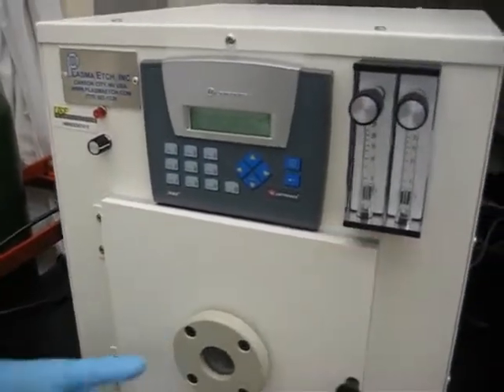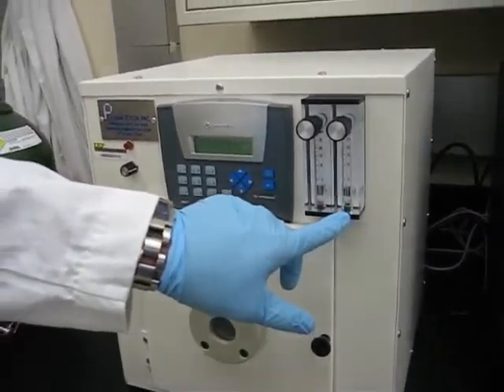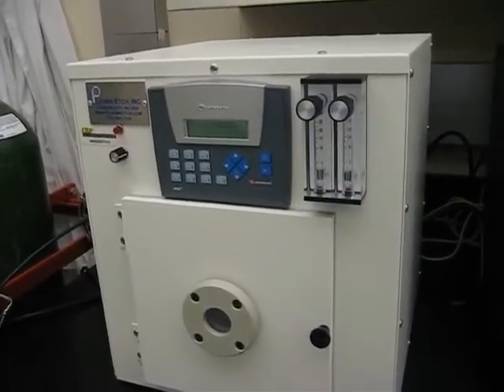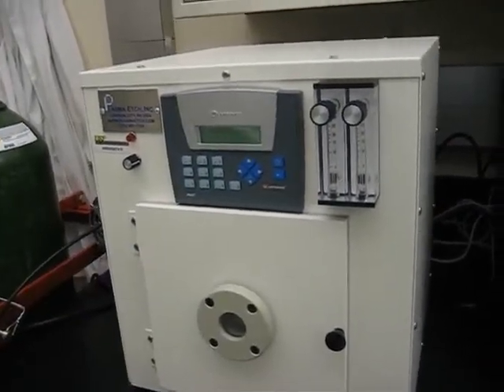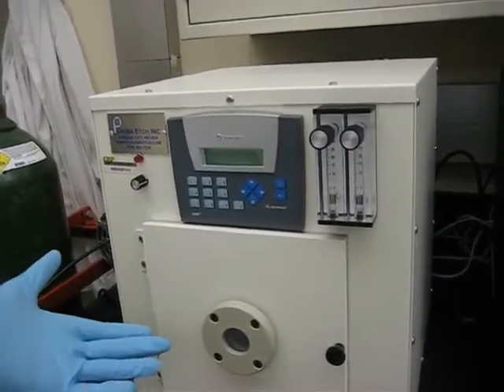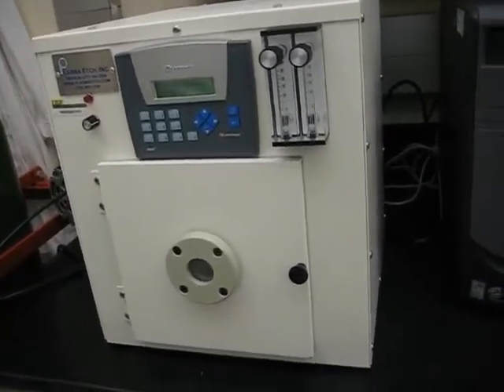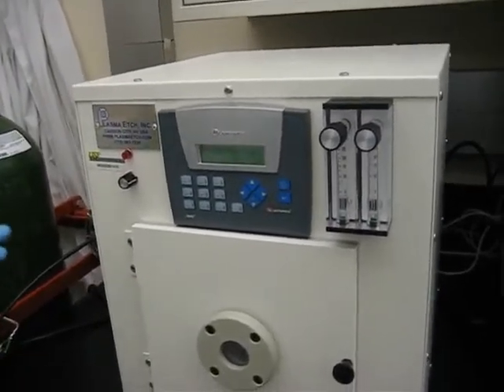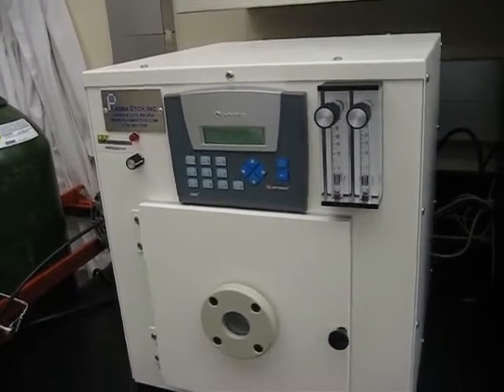Here are the two rotameters, and this one is connected to the oxygen tank — here we control the flow rate. It's actually preset; we calibrated it before we started using it the first time. We don't recalibrate every time because it's the same cover slips used many times, so we keep this program set.